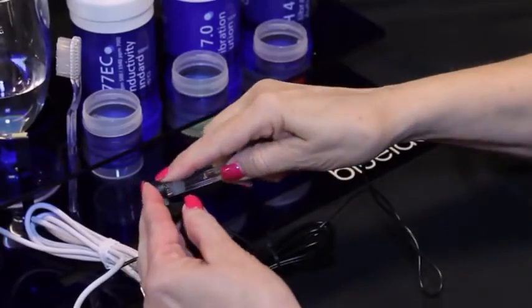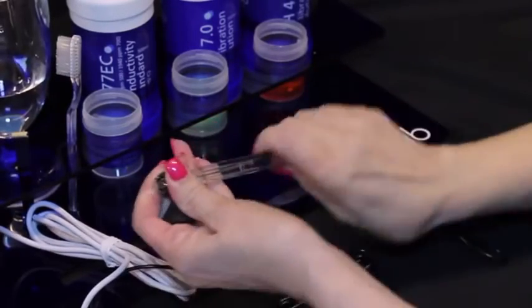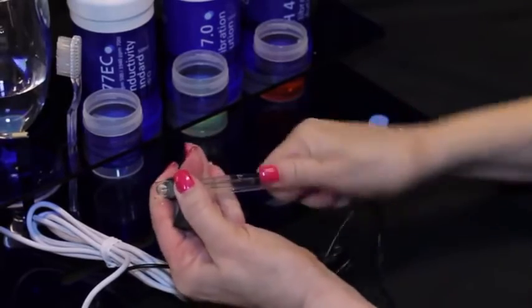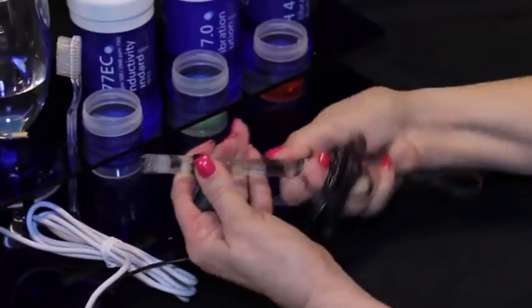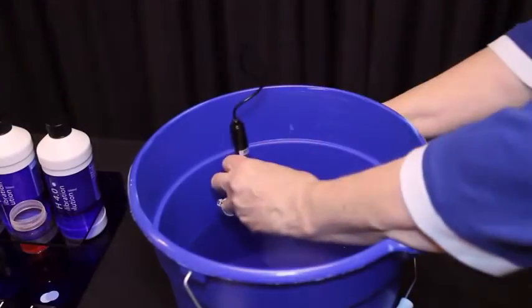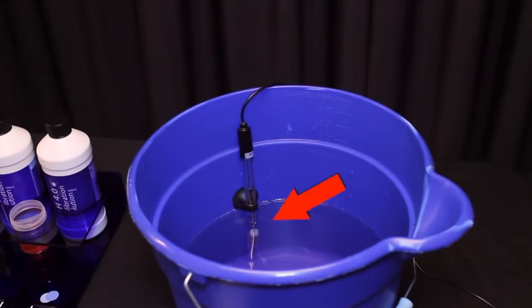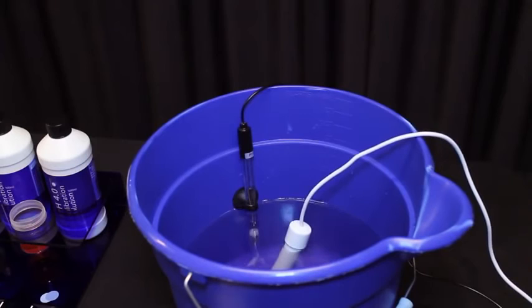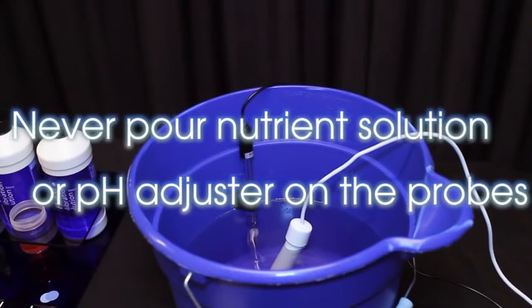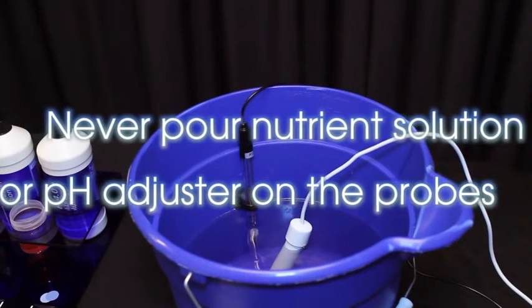Both probes require submersion in the liquid for a measurement to occur. The pH probe comes with a suction cup to prevent permanent damage to the glass probe. Remove the pH probe storage cap, then gently twist the suction cup onto the stem of the pH probe. Lightly push the suction cup onto the side of the reservoir, far enough down so the pH probe is in the solution. Place the conductivity temperature probe in the solution. Pouring concentrated nutrient solution or pH adjuster on the probes when in the reservoir can damage the probes and may trigger the alarm if it has been set.